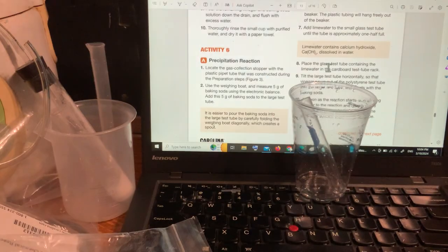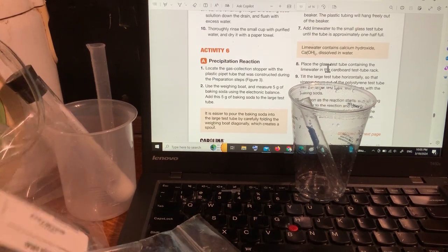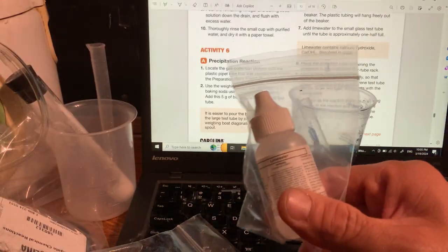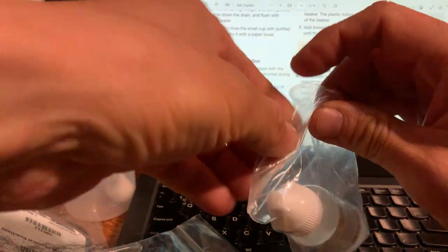Oh, wow, I found my bag of chemistry chemical set 2. But the lime water, I don't see it there. Is this it? Yes, this is it. I think this was in the bag that was called chemistry chemical set 2, but this is the lime water. See, it says lime water. Lime water is calcium hydroxide dissolved in water.